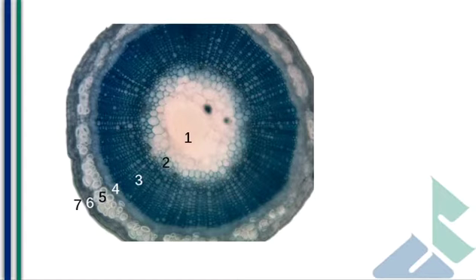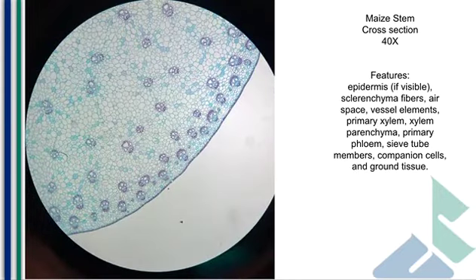Now, looking back at our flax plant, we see that there's no breakup in where the xylem is. The xylem is in one continuous ring. That's very different when looking at monocots. In dicots, the continuous ring is a feature. You have concentric circles playing a role in determining the stellar anatomy of all of our dicots.